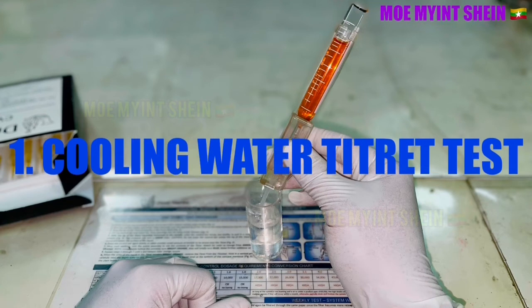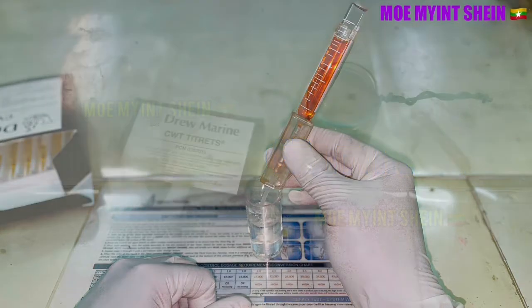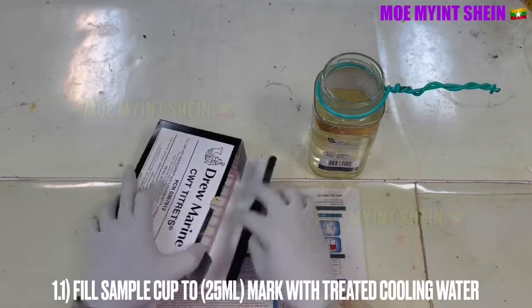Cooling water is used for engine cooling. The quality of engine cooling water needs to be tested regularly and treated if necessary. As first, the cooling water treater test will be carried out.